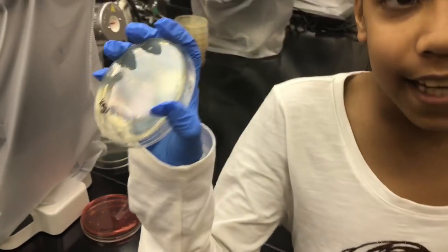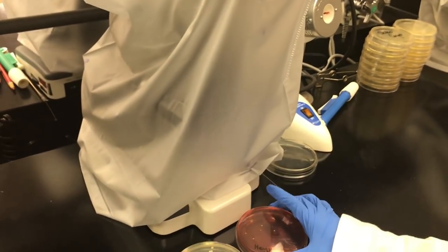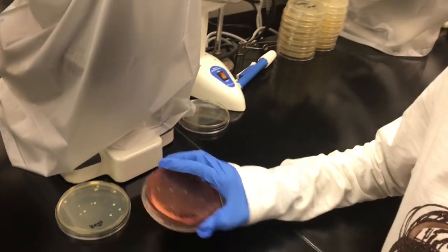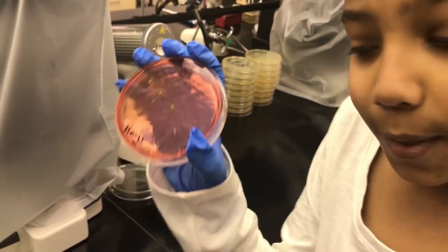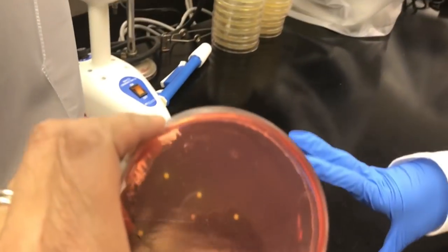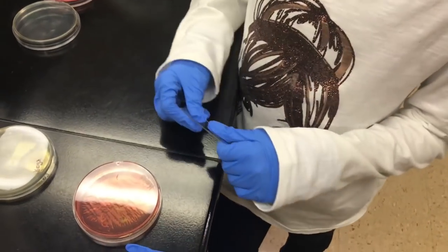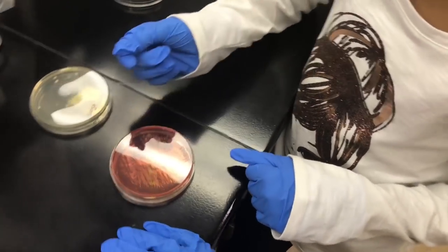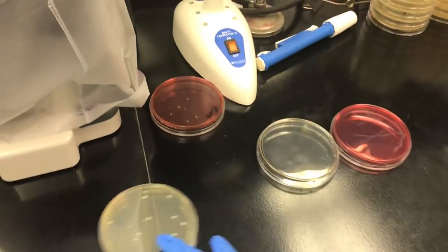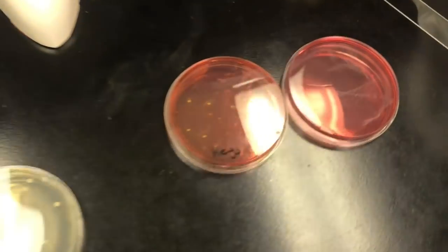So the keys had some normal bacteria, not that much. But it also had some Staph. But what I'm thinking is, you know how the human hand is always touching keys? There's normally Staph on your hand. And to check it, I'm going to be doing a simple stain, and I'll be checking it on this slide.